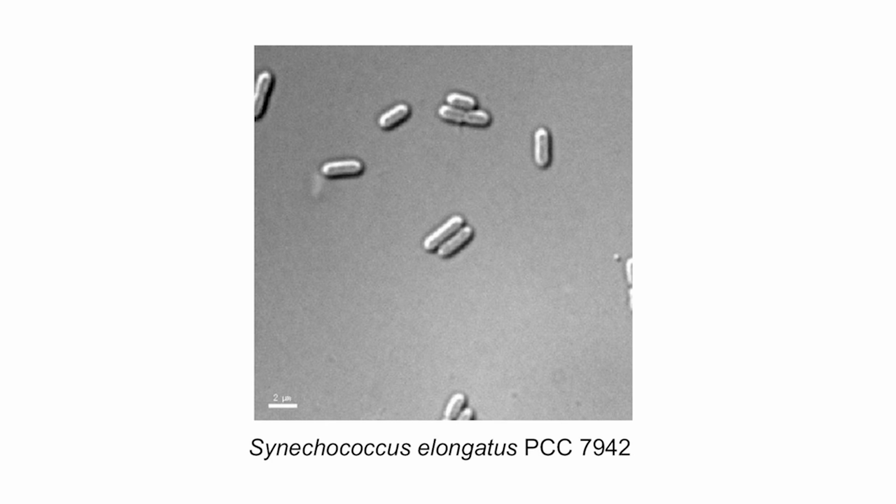In order to visualize the cycling of rhythmically expressed genes, we will first insert a reporter into the genome. In this case, we are going to use luciferase. The species of cyanobacteria we are using today is Synechococcus elongatus PCC7942, which can be easily transformed, meaning that the cells readily take up exogenous DNA.